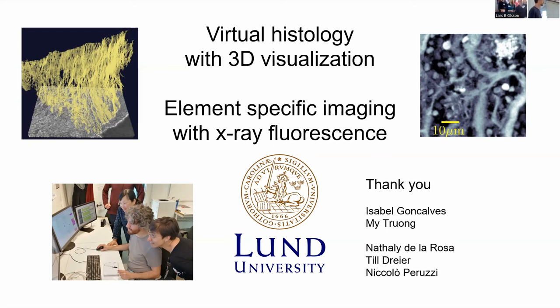But then we're talking large animals and live species. Well, I think the large animals are probably rodents. Live animals, yes, versus excised tissue in smaller samples, like skin. If it's excised, it's much easier to handle, of course, which is why that's what we're doing now. We can easily bring the samples to other instruments. It's just easier, but it's definitely possible to do in vivo imaging also.